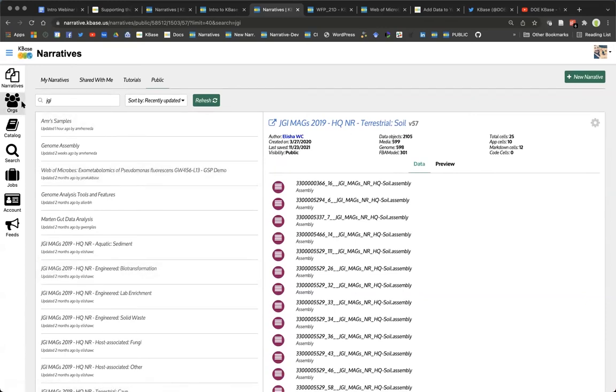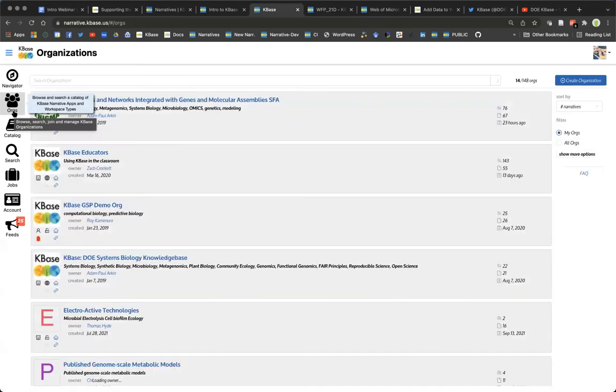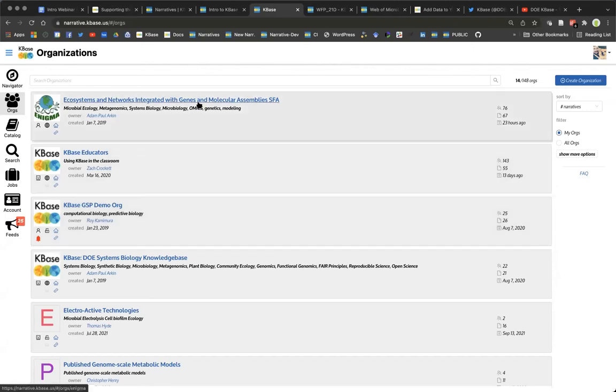Real quickly going to go through some of this other stuff. I know that there's probably some questions in the Q&A that I'll get to in a second, but I just want to make sure we cover all the basics here in the time we've got left. I know I'm close to the top of the hour here, but you may have seen some reference to organizations in the interface. Organizations allow you to take a set of users and pull them into a common org where they can then have access to a bunch of narratives that have been shared with the org.